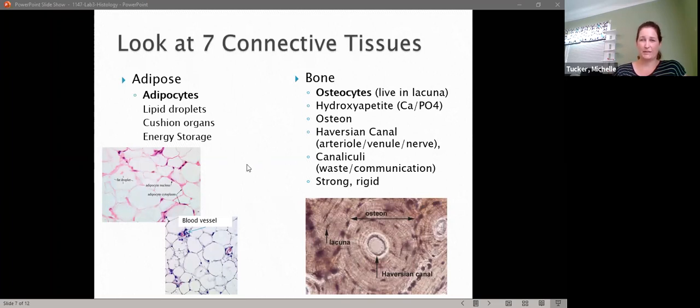when you're studying, because it might be a couple weeks to your lab exam, but with adipose tissue, these are spheres because they contain lipid droplets, they contain oil. So these are spherical, this is a nucleus, and then these are blood vessels. So this is a vascularized tissue. And each one of these is its own cell.